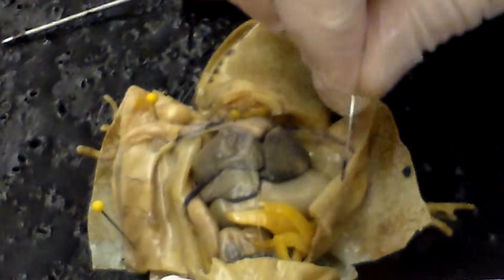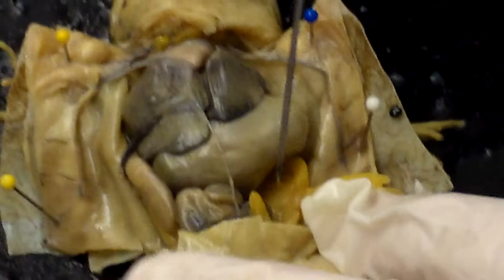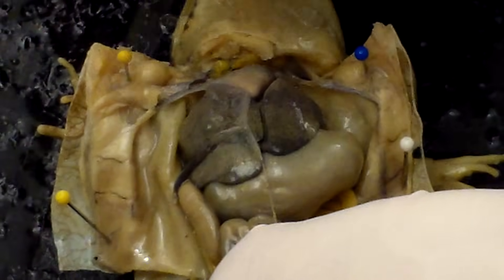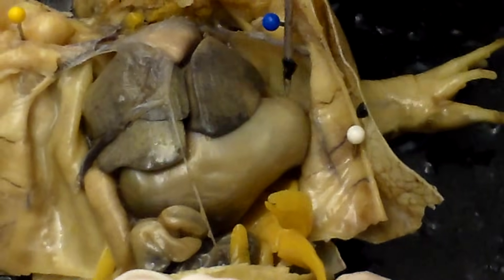Now we need to pin the frog down and open these flaps so we can see inside. Some of the structures we'll notice right away are these yellow structures — these are fat bodies, which allow a frog to store energy over a wintering period. Below that you see this long winding small tube, which is the small intestine. The small intestine is connected to the stomach — that large structure right here, that's all the stomach.